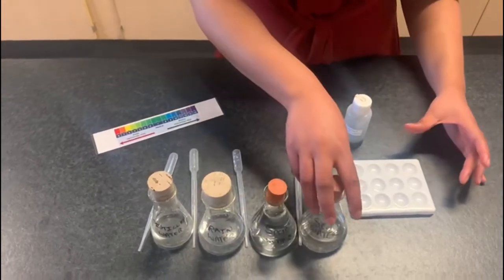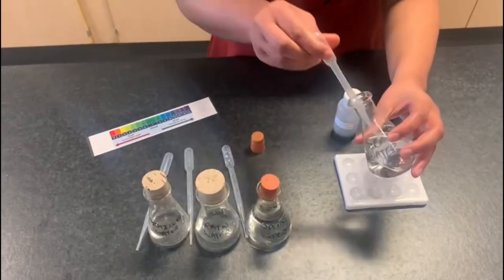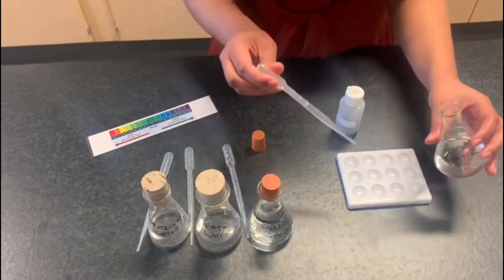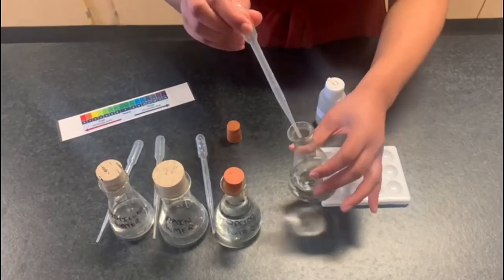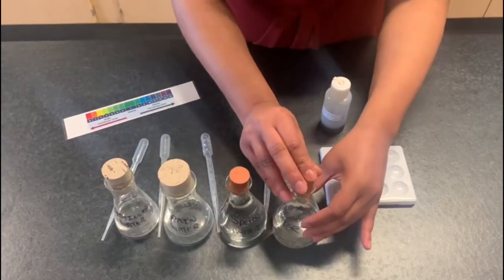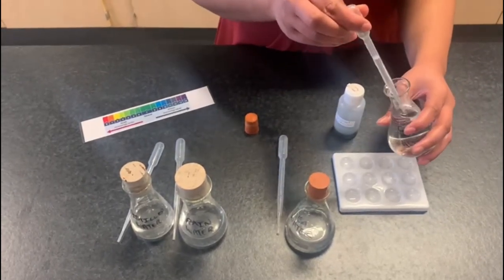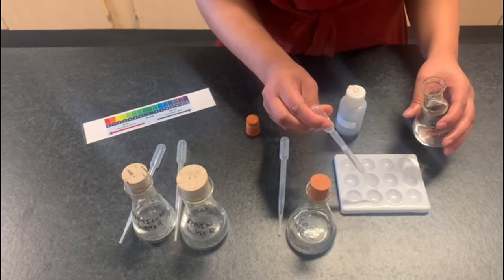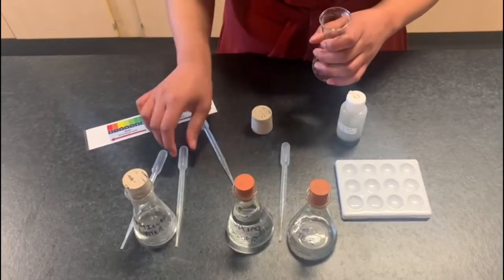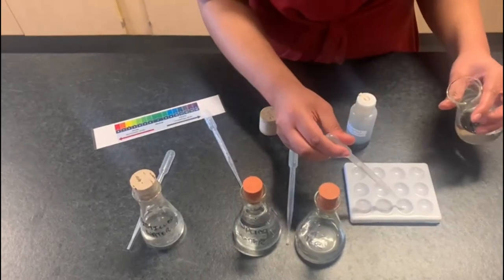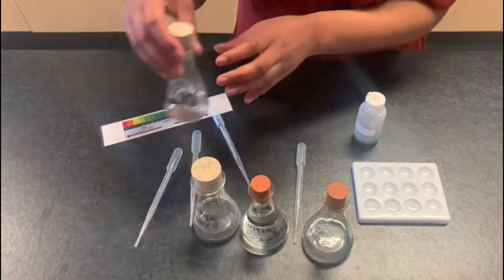So first of all I have seawater. I'm going to use the pipette to drop a few drops of the sample into the spotting tile. You don't need too much, just fill it halfway. I'm now going to put in spring water sample, and lastly, distilled water.